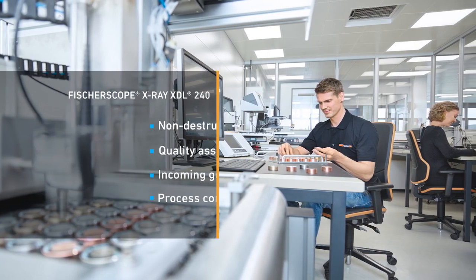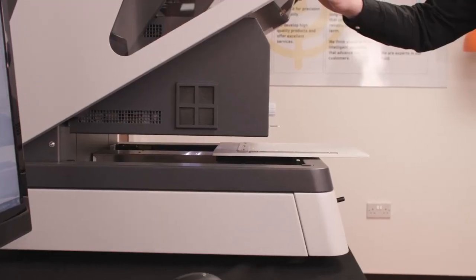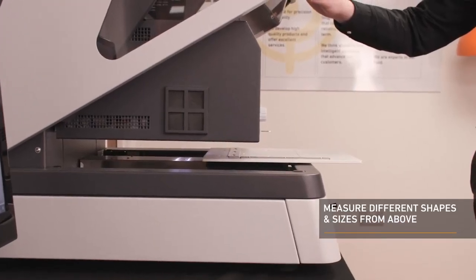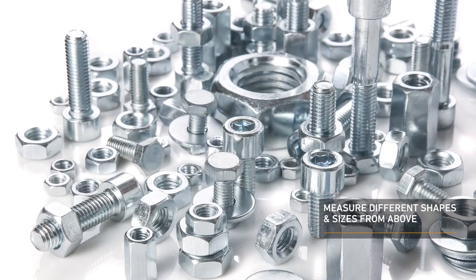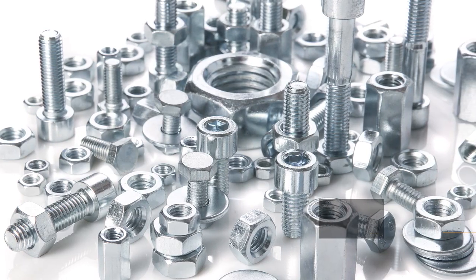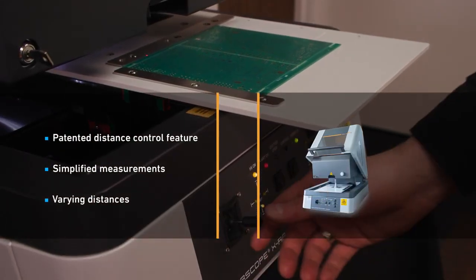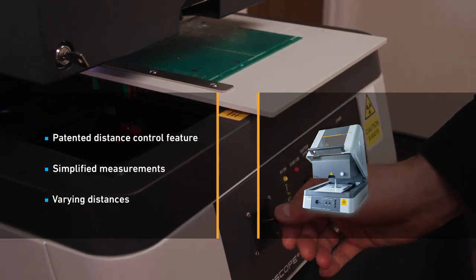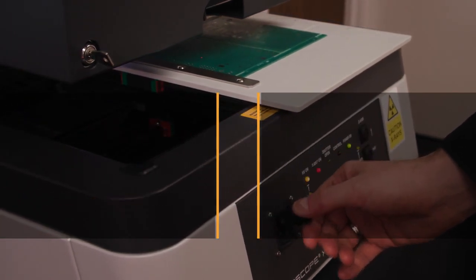Testing of multiple measuring points is possible with this instrument. X-Ray beam direction is from top to bottom, so the sample is measured from above and can easily accommodate large or small samples. Optical focusing is quick and easy for complex-shaped samples, and a specialized safety system prevents contact between the sample and the detector.